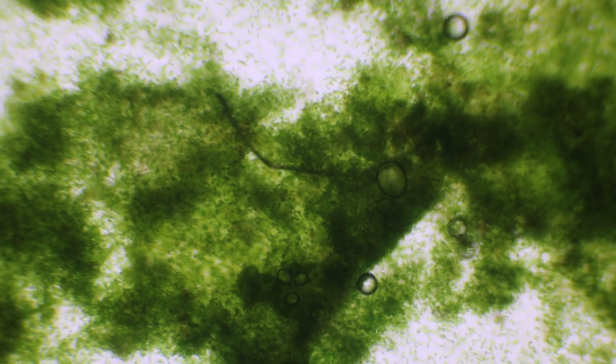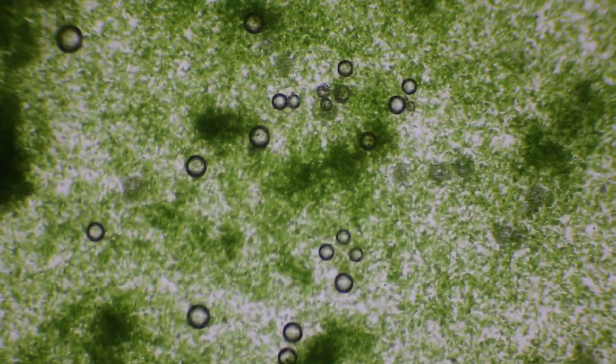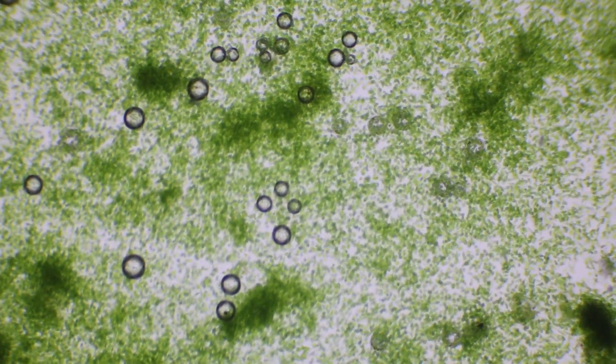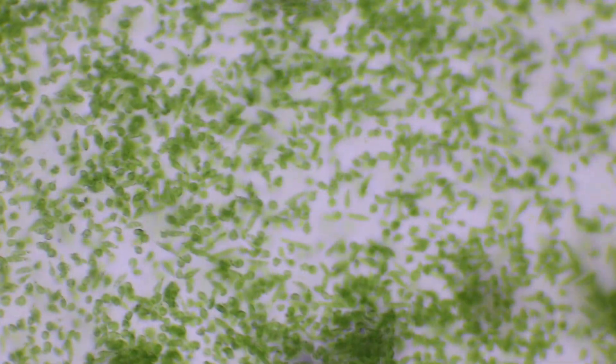This is a bunch of euglena from one of my cultures. The entire thing had turned green with these larger blobs, which are actually encysted euglena and free-moving euglena. This was taken from a biofilm at the surface, which had actually entirely turned green, with harder parts from these darker areas of euglena that have stuck together and encysted themselves.